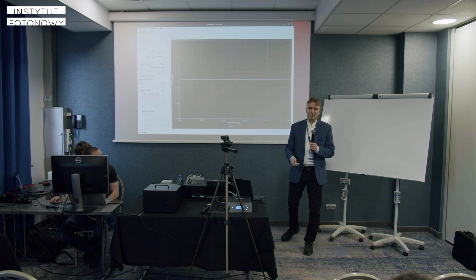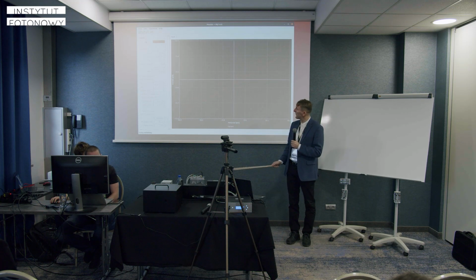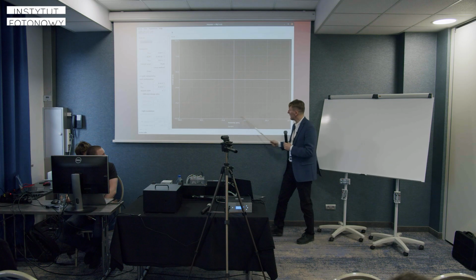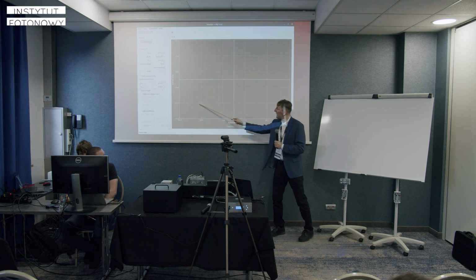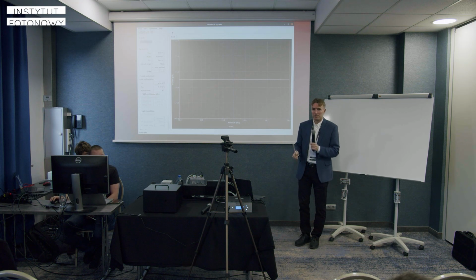If your sample is linear, it should show straight lines. Not many of them, but if you have one sweep, this produced a line. There's a linear sample inside. It is a capacitor and resistor in parallel. So when you do the sweep, you see this straight line over here, and certainly a straight line down there. But there are some glitches here, and I wanted you to notice them.